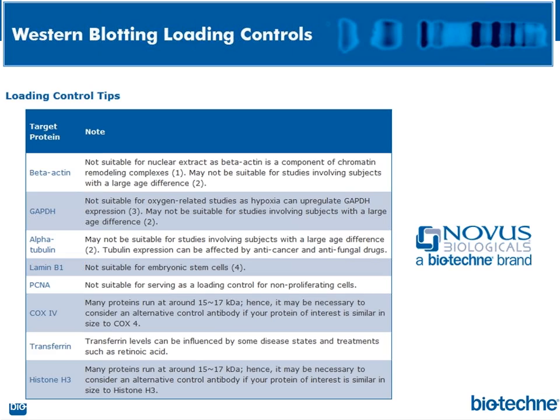And I would say that the best thing is, there are protocols obviously, but there's no substitution for real live experience. Amanda and I were talking offline before this webinar, and she came from a biochemistry lab, and she ran tons of Westerns. Find somebody that's been running lots and lots of Westerns, that knows the tricks, because following a protocol or recipe is one thing, but to be able to work side by side with someone that can show you the tricks of the trade and do slight manipulations here and there is probably more powerful than just a protocol.